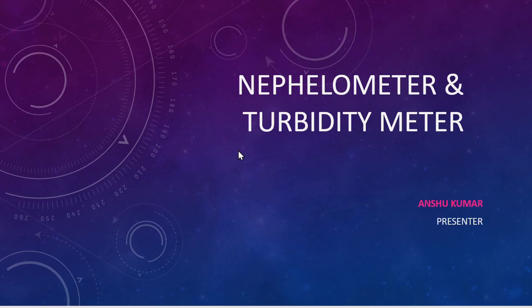My name is Anshu Kumar, and my topic for presentation is nephelometer and turbidity meter. These are the analytical devices used to measure the turbidity of a solution or liquid.